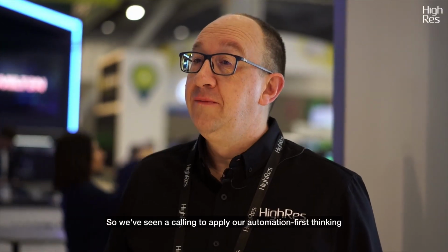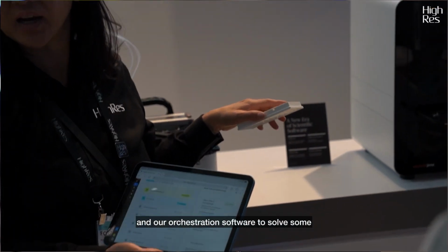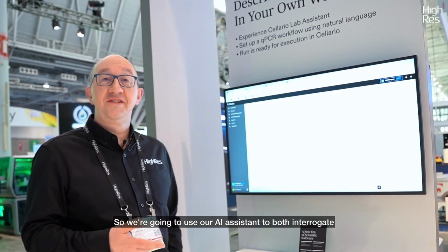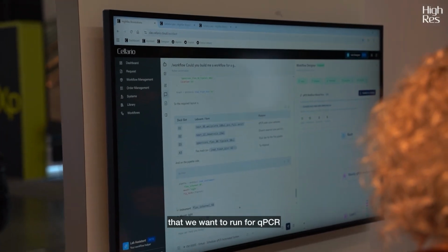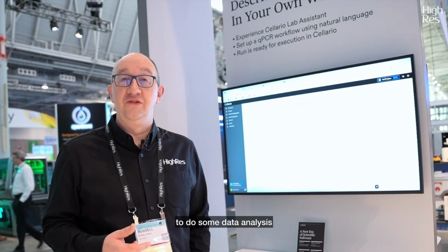So we've seen a calling to apply our automation-first thinking and our orchestration software to solve some of those challenges. And that's what we're going to show today. We're going to use our AI assistant to both interrogate what is possible to be done in our lab and instigate a workflow that we want to run for qPCR. Then we're going to go into the lab and go through that workflow step by step, and finally use the same AI assistant to do some data analysis.